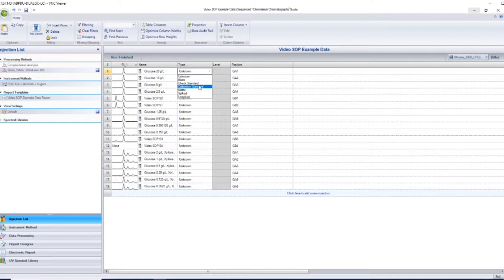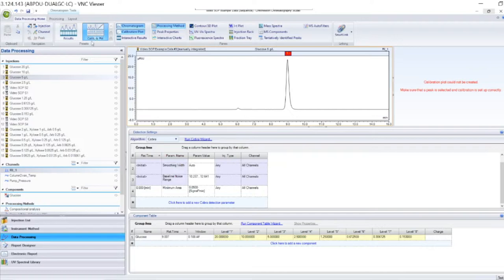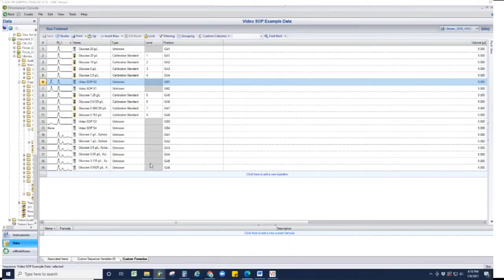To define calibration standards, click on the injection list and name all calibration standards as necessary. For each calibration standard, click Level and assign or create a new level. Next, navigate back to the Data Processing tab and select Calibration and PM. In the Component table, update the table to reflect all calibration standards, and in the Calibration Level column, update all concentrations. To create a report template for the data, navigate to Create and select Report Template.